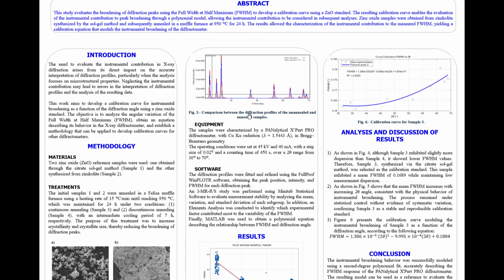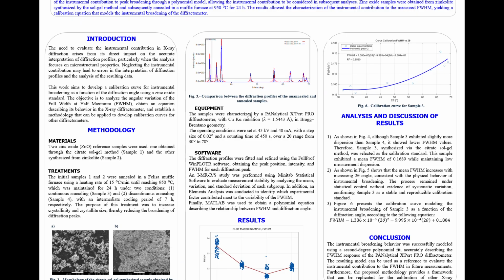The need to evaluate the instrumental broadening in X-ray diffraction arises from its impact on the accurate interpretation of diffraction profiles, especially when the analysis focuses on microstructural properties.